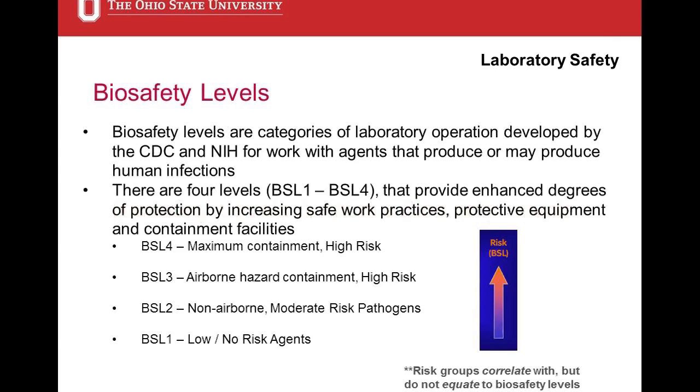So most likely, if you work with risk group 2, you'll work at biosafety level 2, risk group 3, biosafety level 3, and so on, but not always. So again, that's the other reason for the risk assessment. That's why your protocols get reviewed by the Institutional Biosafety Committee, and we make those judgment calls and those assessments.